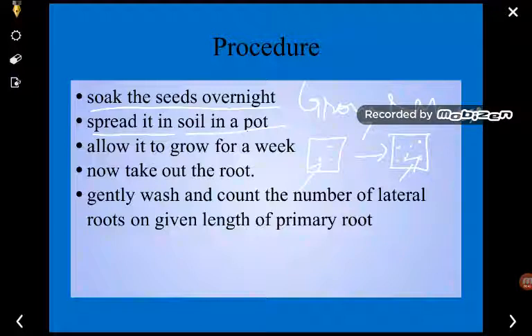If it is more than 8 centimeter, then we can easily uproot this type of plant. So after 7 days, you can find out the growth of the plant has taken place, both groundnut as well as moong. Now we have to pick out the root, we have to uproot so that we can get the upper part as well as the lower part. While uprooting it, we are going to remove it slowly, so that each and every part of the root should be clear and should not break at any movement while uprooting it.